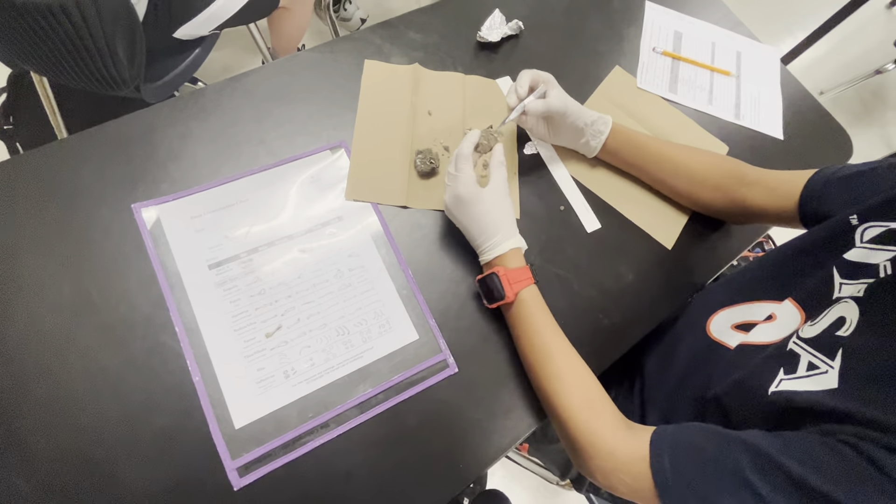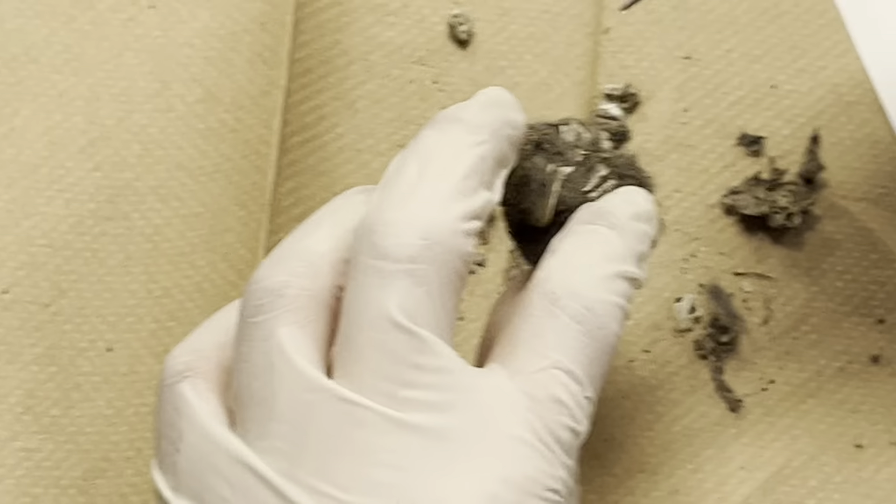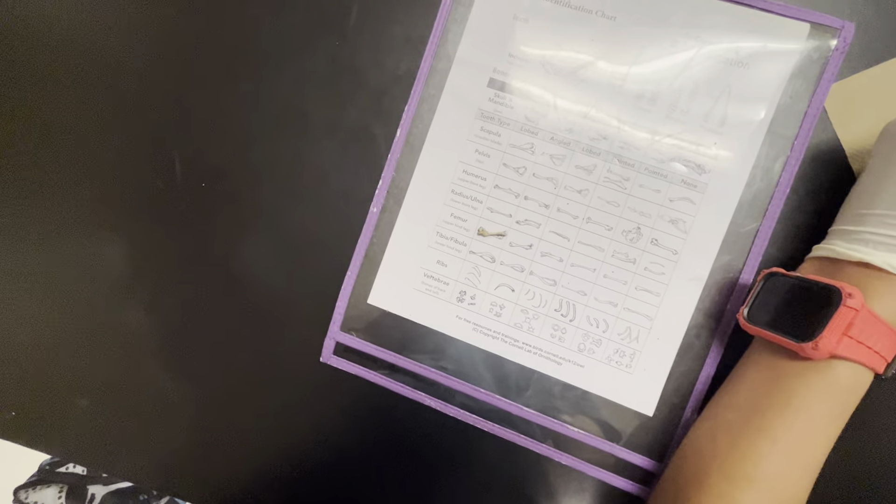I found a skull and it broke. Oh — bone right here! Oh, never mind. I don't know if that's a femur or not, but we'll come back to this. Are these beaks? Look at these orange things — are these beaks? Pull it up.